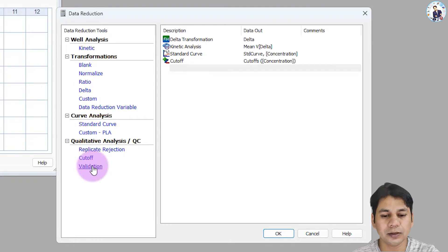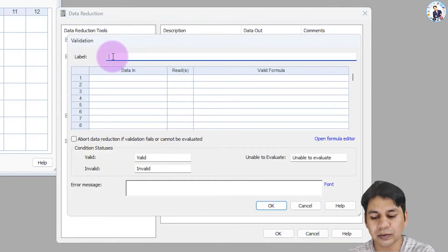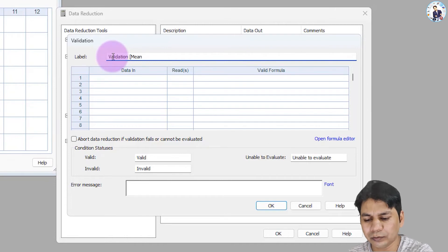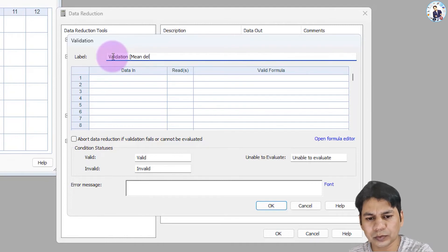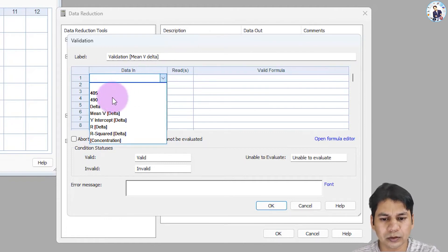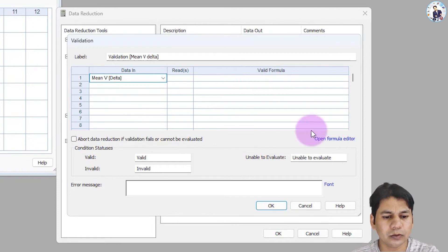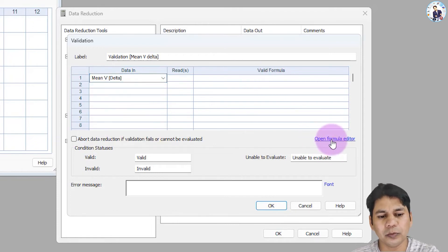For validation, I am labeling it 'Validation Mean Delta Value.' You have to select the data input here — I am selecting mean value delta. Now click on the open formula editor.